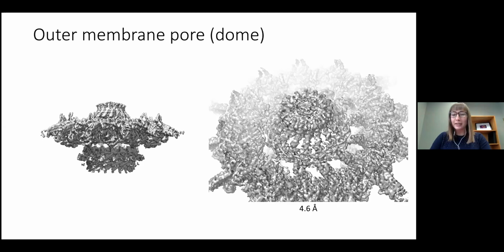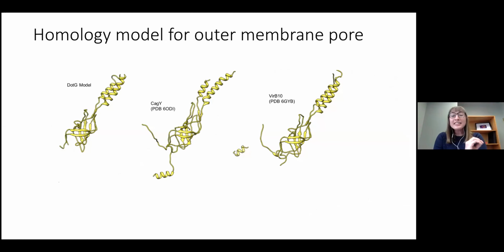as well as between the OMC disc and the periplasmic ring. The other thing, if you remember, this is the range where I said if we had a good model, we could start to fit it into the map. And I also made kind of a big deal of saying there's no sequence homology. There are no good models. This is the one exception.